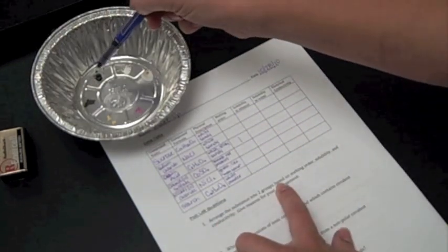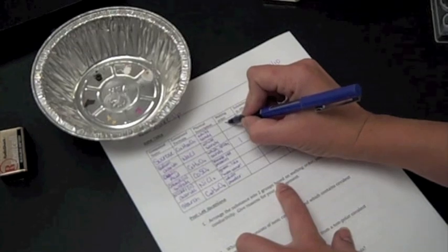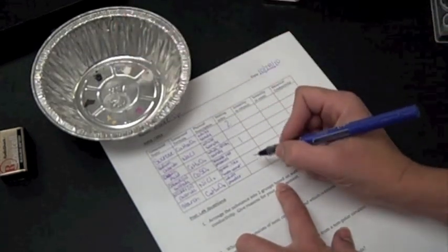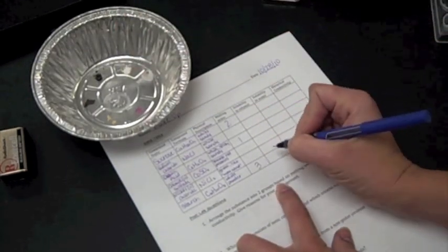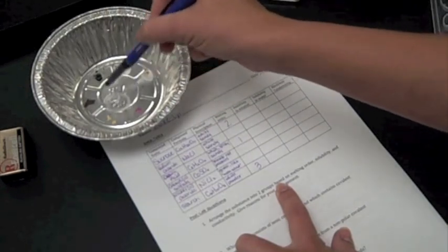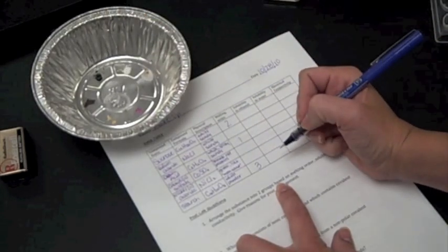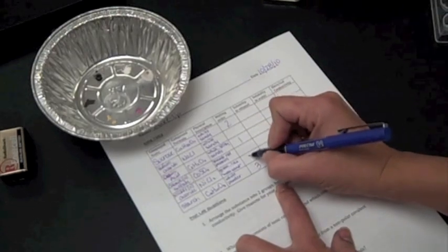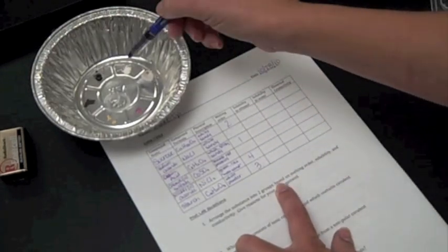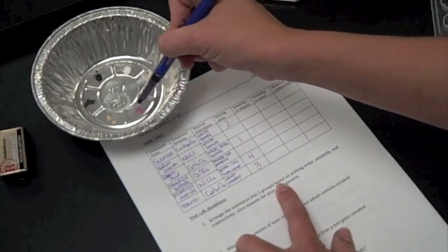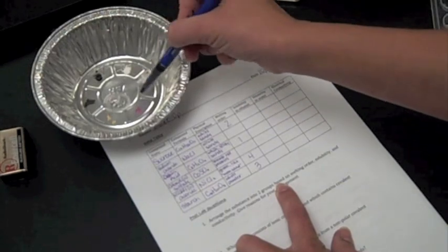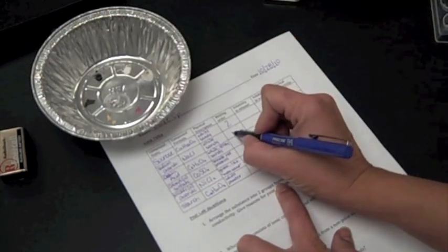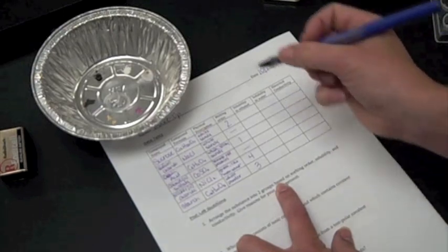And then came this guy, so the sucrose melted second. And then this was number six. It melted third. And then I would probably call nickel chloride my fourth. It didn't really melt, but it definitely underwent some kind of funky change. So we're going to go there.